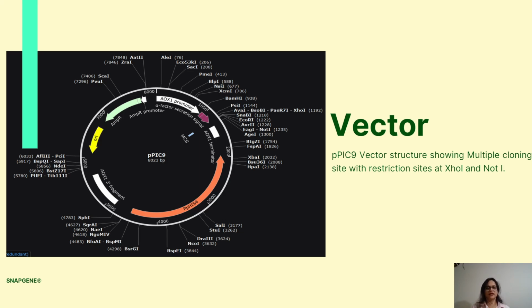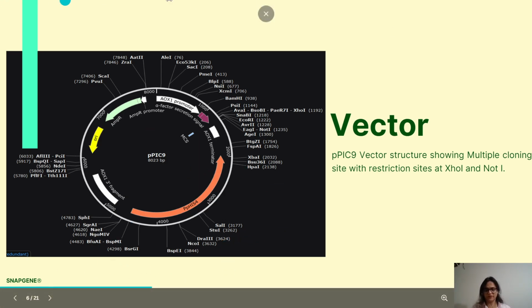As P. pastoris naturally lacks significant secreted protein, the total protein amount of the supernatant is associated with the recombinant peptide when a culture medium lacking protein and peptide is used. This enables P. pastoris to grow in a peptide-free culture medium.